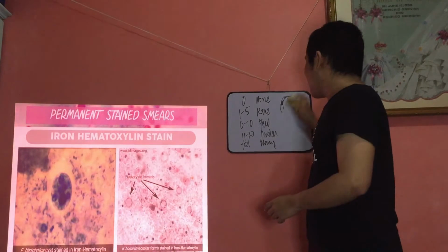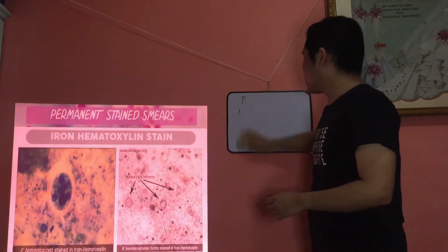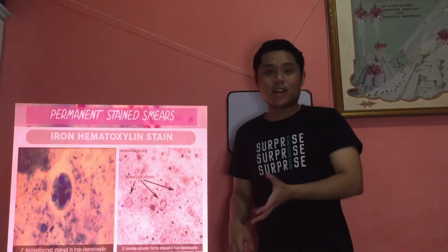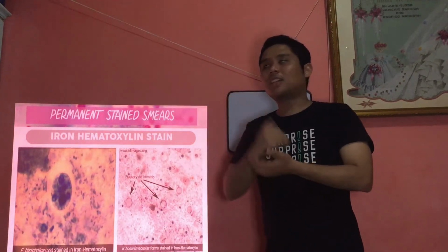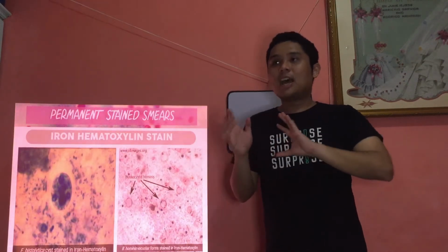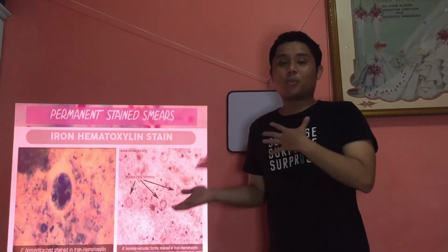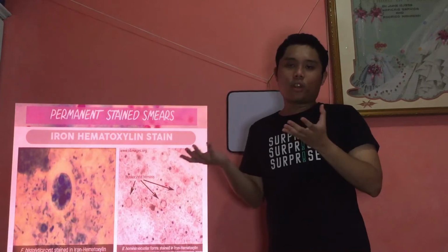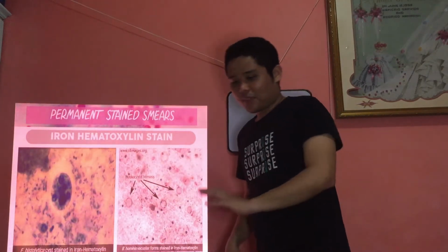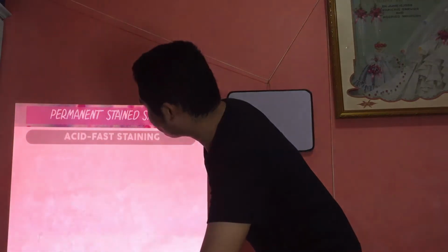Now we go to the last staining procedure. But before we proceed to it, which is modified acid fast, I will discuss not a little, but quite a lot about acid fast staining, so that you will understand why it is called modified. Of course, it is modified because there is an original, which is the acid fast. So that's what we're going to discuss.